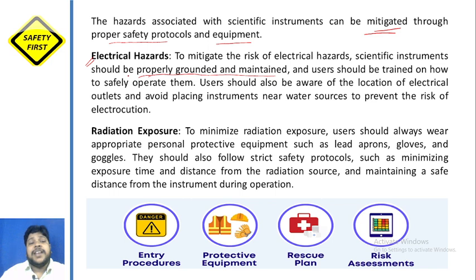There should be proper vigilance over it, that it has been maintained, and users should be trained on how to safely operate them. Users should also be aware of the location of electrical outlets and avoid placing instruments near water sources to prevent the risk of electrocution.